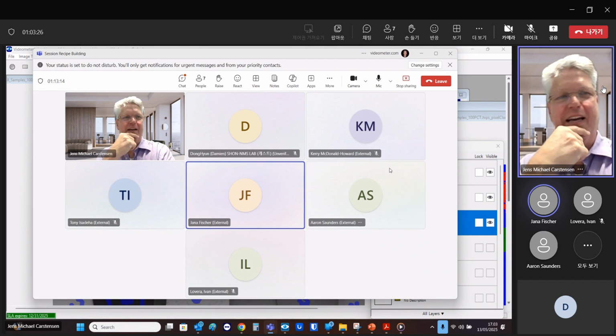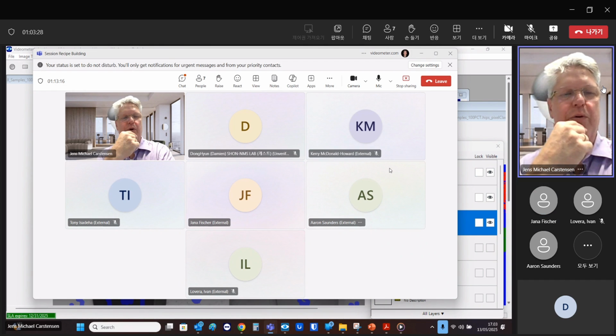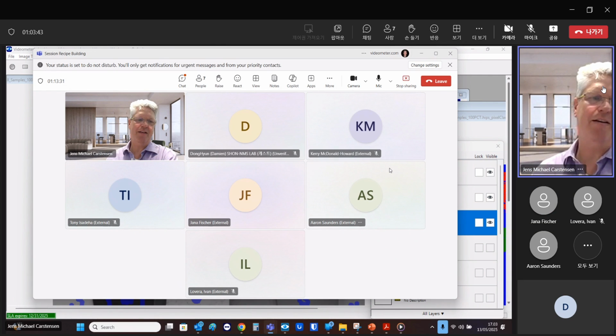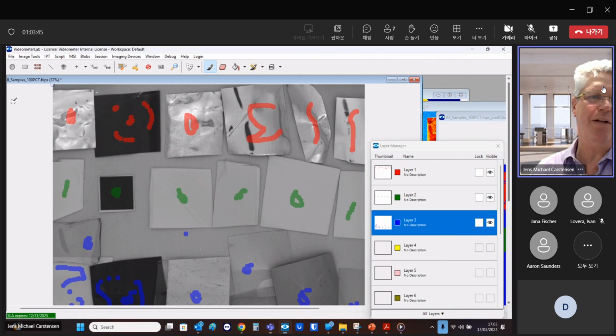how to do that. In the beginning, we will not have everything populated, but it will be easier for us when you have a request. We typically prioritize people who are on service contracts, of course. So if you have ideas, then let me show you that as well.